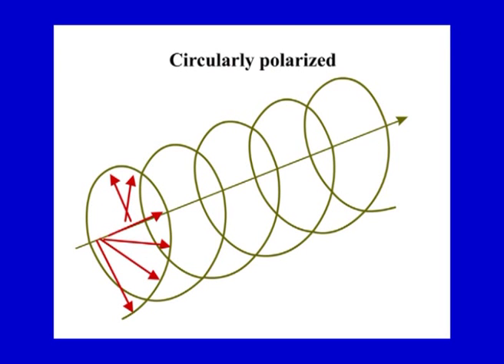For right circularly polarized light, from the direction of propagation, as the observer is seeing, it rotates clockwise. So, for left circularly polarized light it is counterclockwise, and for right circularly polarized light it is clockwise as per the observer's position. As you can see, this is in a particular direction, and it is circularly polarized light propagating in a particular direction. So, this is how circularly polarized light is produced. There could be left circularly polarized light and there could be right circularly polarized light.